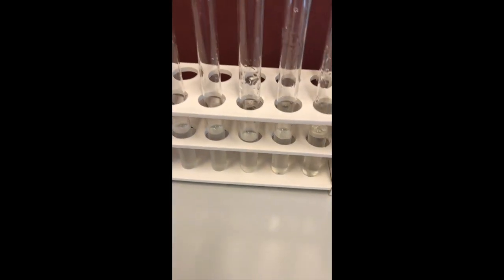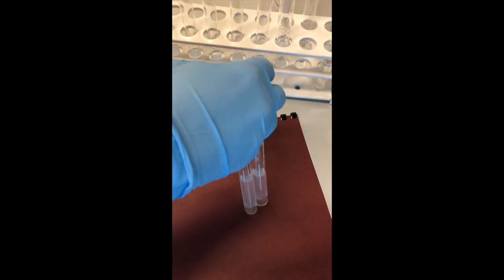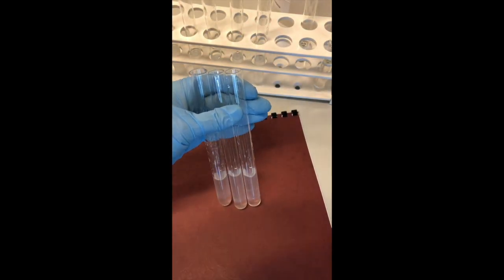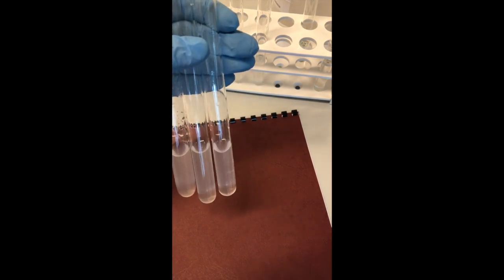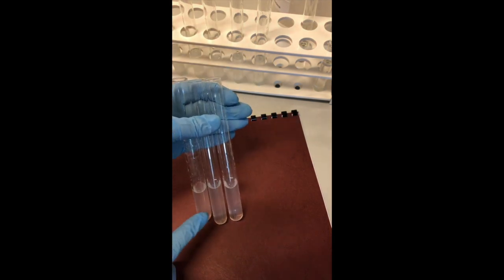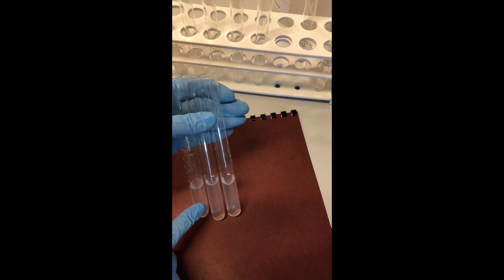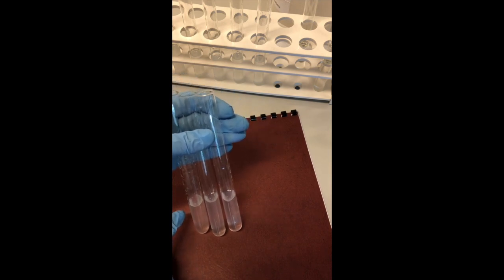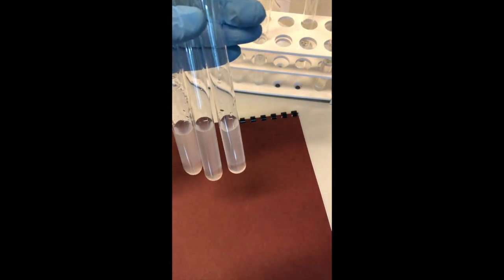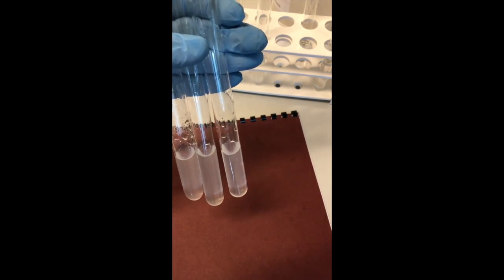Let me show it again. We take our sample, put it in the middle, and on the left we put the lower concentration, on the right the higher concentration, and we try to compare. It's not seen on the movie, but in my opinion it's rather the higher concentration, so this will be 0.2 cubic centimeter, and we have to calculate it into the content of sulfur dioxide and next into the concentration.